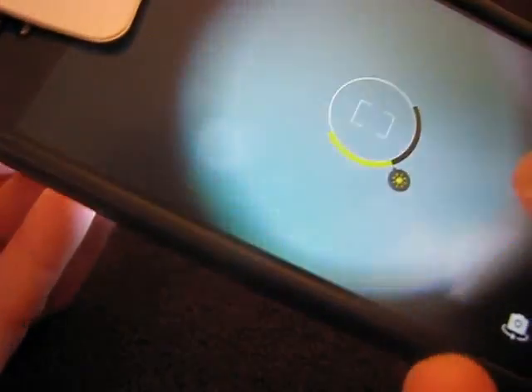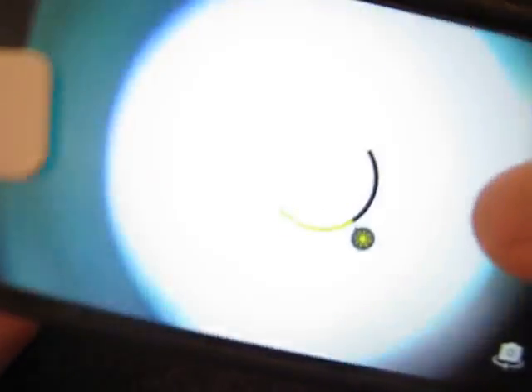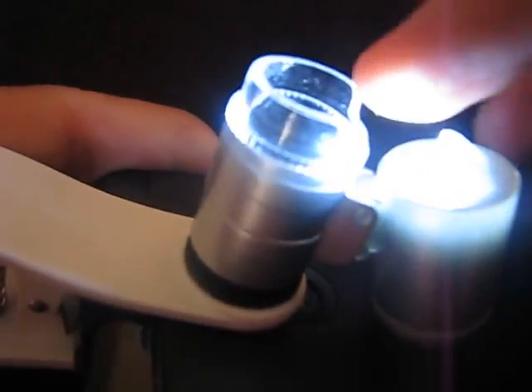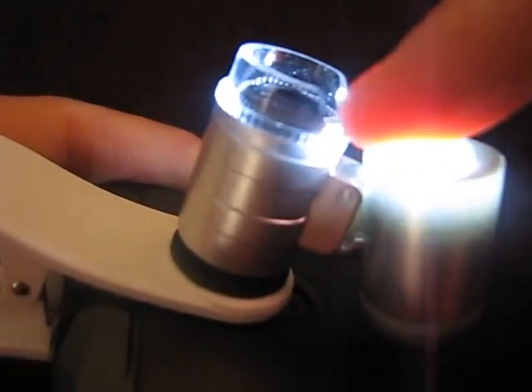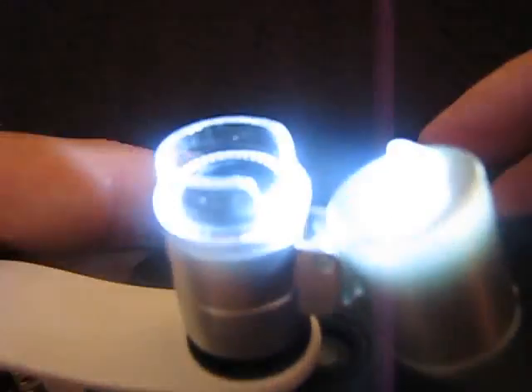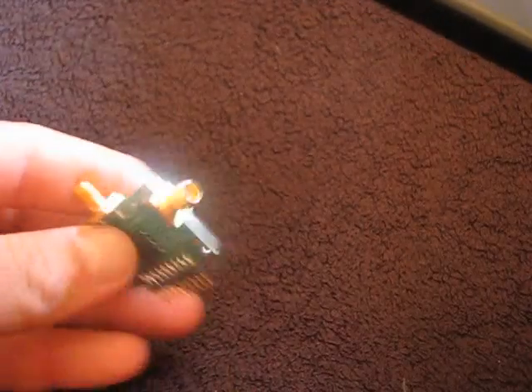So you have to play a little bit with it. The microscope has a strange-shaped plastic at the bottom, so you can play with the positioning a little bit to catch the focus.